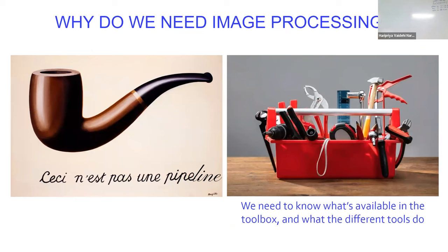It's not a pipeline. It is rather a toolbox where you have a whole bunch of tools that you can use. And the whole point is to understand what kind of tools you have, like what does this thingy do? Or what does this blue thingy do? Once you know what it's going to do to your stuff, then you know whether it makes sense for you to use it or not.